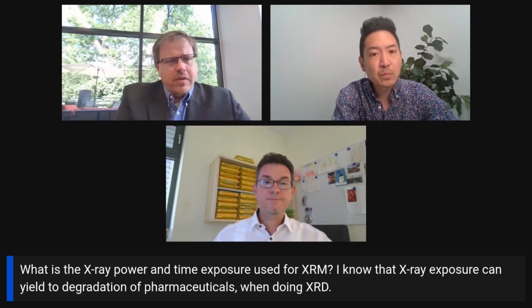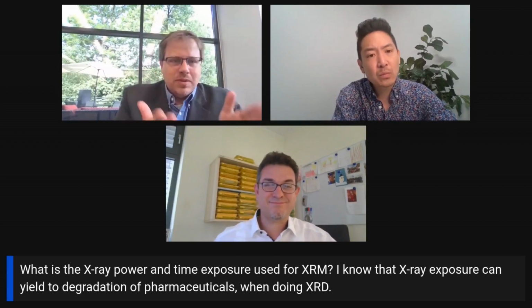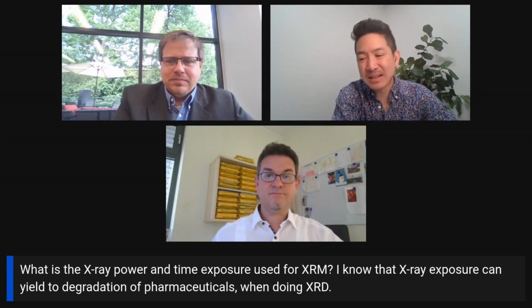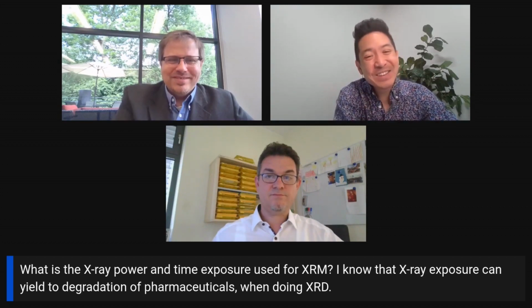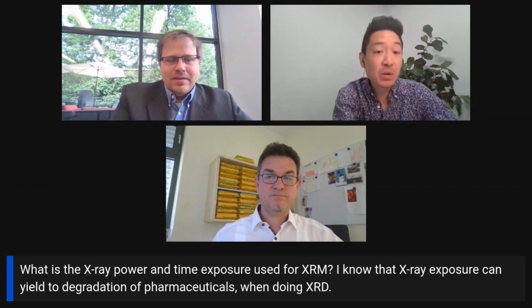Okay, yeah, and we don't have an SCD or single crystal diffraction expert necessarily here. I know that they use maybe a little bit more focused beams, right, where you might get brighter, tinier, more flux in a certain spot, so you might have a chance. And I think that the statistics part of that also comes into play, right? Because with a single crystal experiment, you've got one. Yeah. And you hope that nothing happens to it. Whereas in powder, often we can kind of take advantage of the fact that there's so much material there.